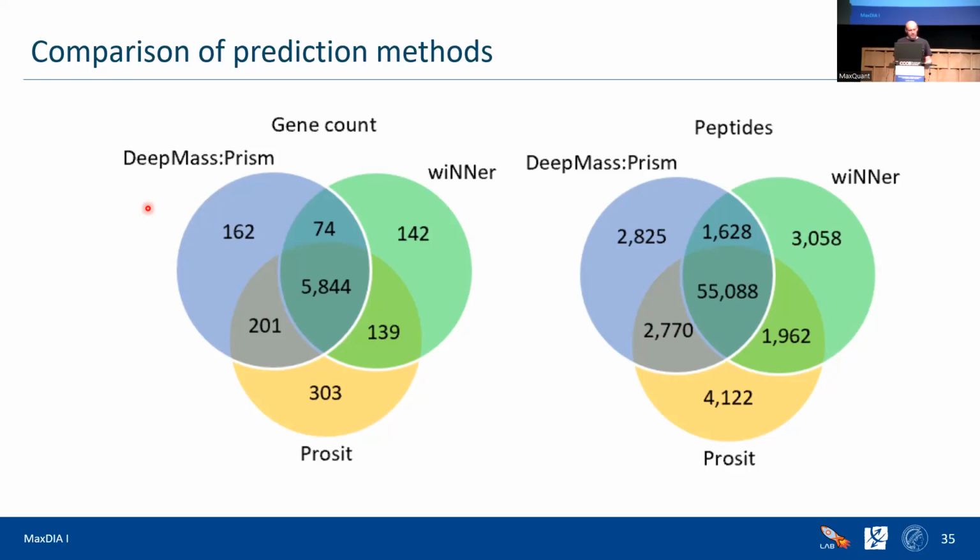And the biggest one is that you always need big data, like 1 million or 2 million examples or something like this. And with that comes computational costs. So that also means that they're usually very expensive in terms of training the model. And so actually for proteomics, that's a bad thing because what they might be very good at is this kind of vanilla flavor of peptides, right?